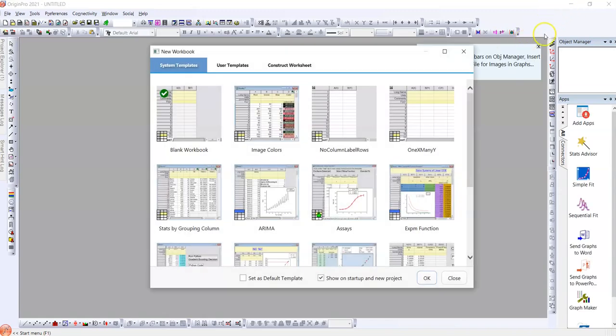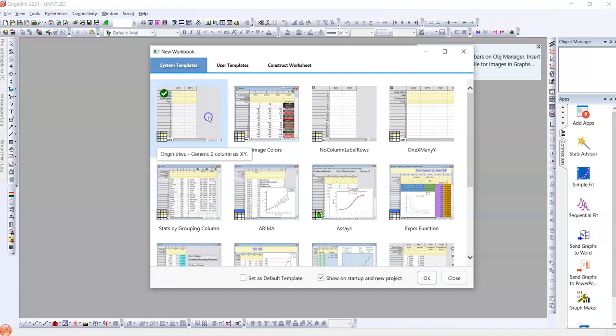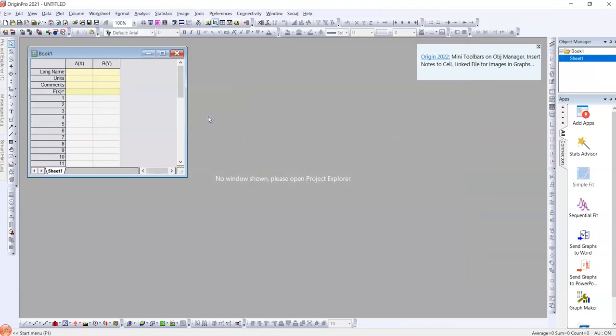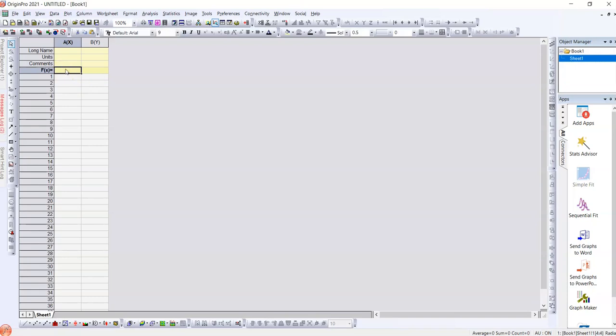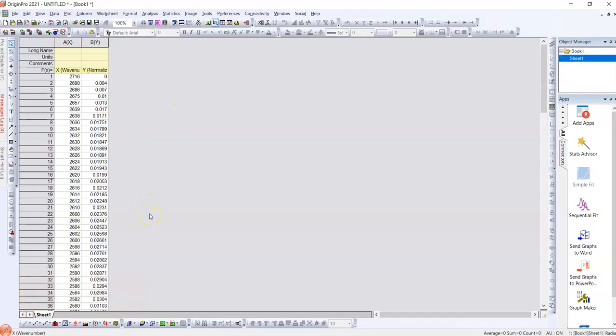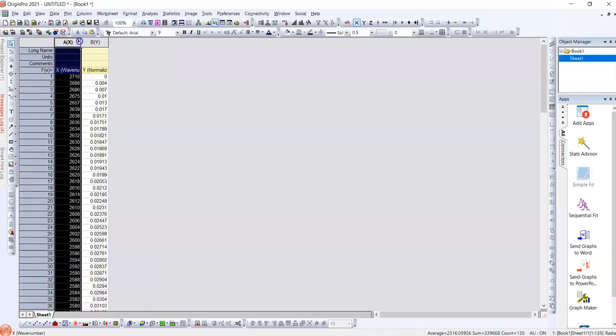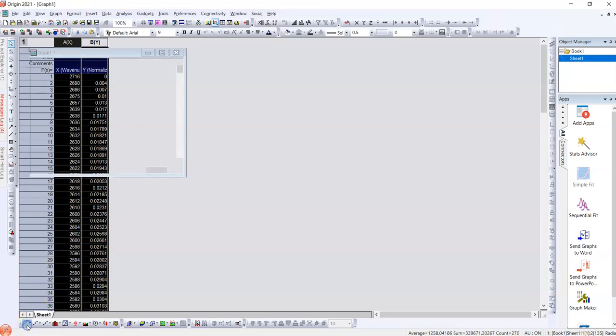These are all the templates of the Origin software. We will double click on the system template where we can put down the xy values from the FTIR data of OD, deuterium. Our data has already been inserted here, now we will plot it using this line bar.